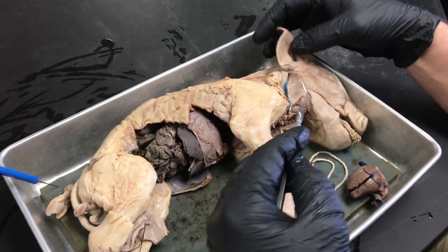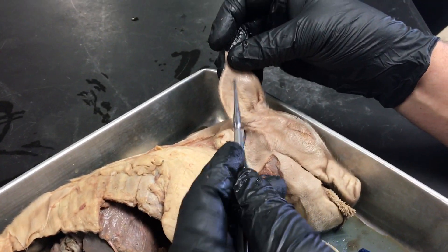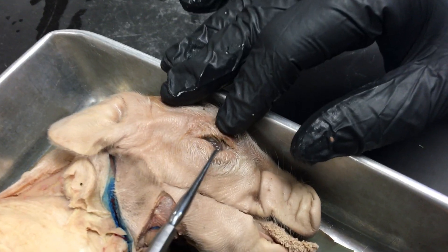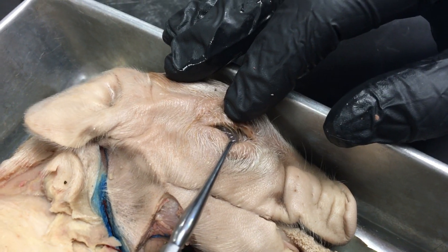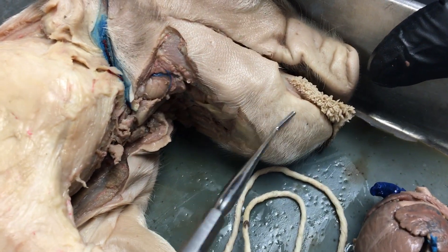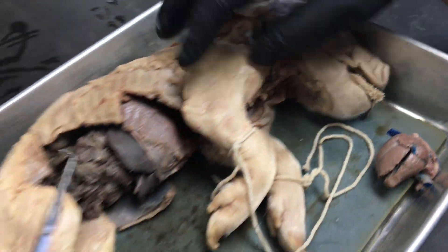We're going to start with external anatomy. Here we have the pinna, which is commonly called an ear flap — in humans we call it the auricle. Right here on the medial surface of the eye you can see the nictitating membrane. Here are the vibrissae, which are the whiskers or the hairs of the chin.